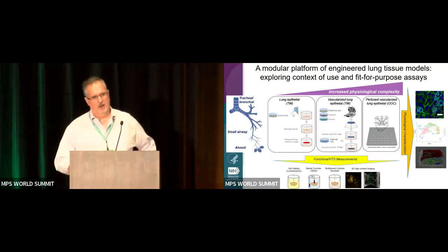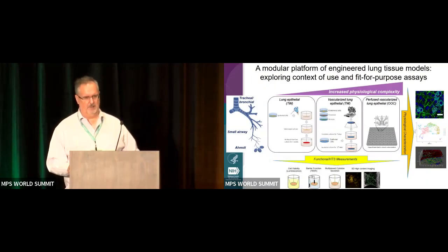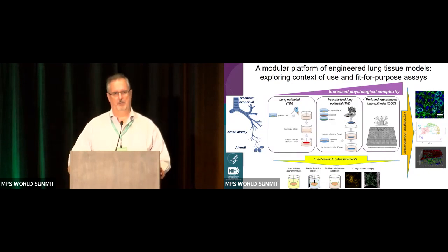So for the lung, and this is a general approach that we use in the lab, modular in terms of diseases, but modular in terms of physiological complexity. And that helps us answer some of the questions in terms of exploring the context of use and exploring the fit for purpose.